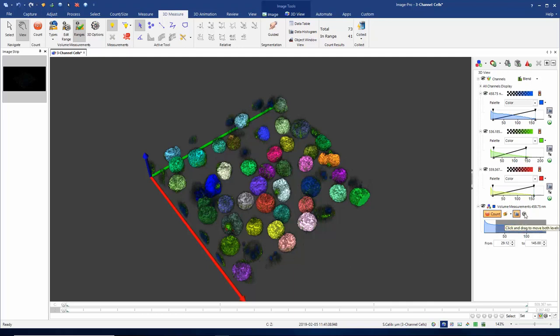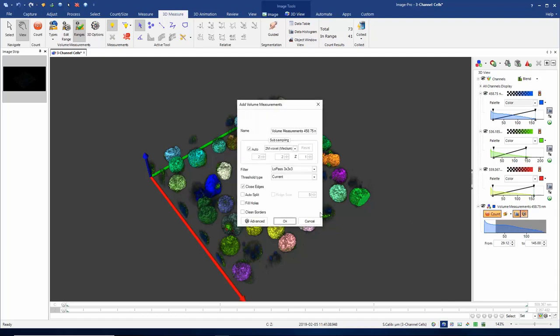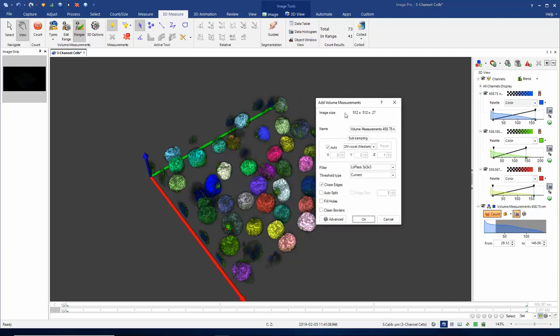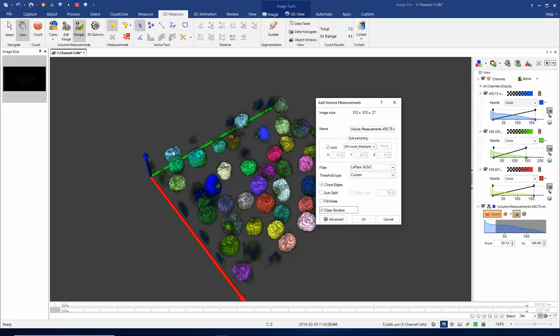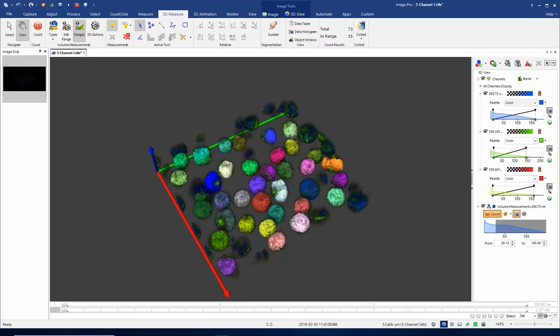Let's take another look at my segmentation options and add the option to include clean borders. Clean borders means that anything that touches the border of the volume will no longer be included. I've got some partially included nuclei here, or some nuclei that are not fully within the volume. If I now click OK with the clean borders option selected, they're no longer included in my analysis.